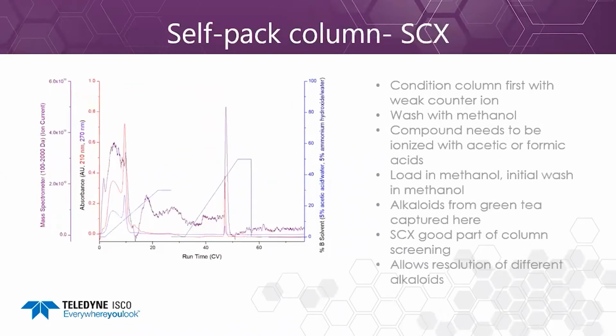A strong cation exchange is possible too. I use a sulfonic acid-based SCX resin. I conditioned it with 1 normal sulfuric acid, so I wind up with a proton counter ion in water, and then I washed the column with methanol.